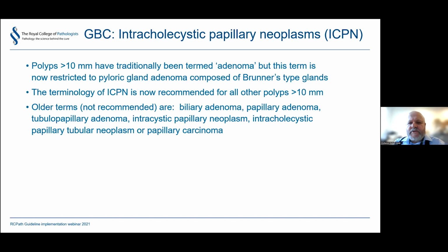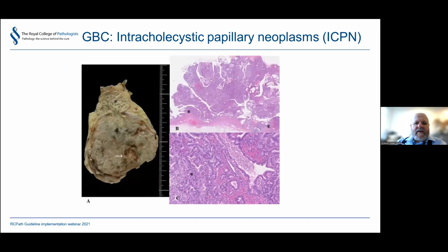There's a whole host of terms listed there, which, as the blue book makes very clear, you should rather avoid using. Just as a practical point, these are very friable tumors sometimes, and you've got to be very careful when you open the gallbladder not to wash them away. Some pictures show the papillary structure and the dysplasia here. And of course, you need to examine it very carefully to exclude underlying carcinoma.